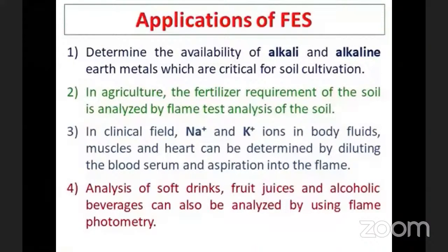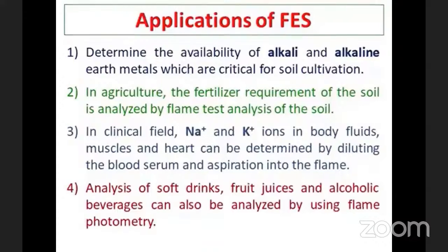Another application is in the clinical field. Na+ and K+ ions in the body fluids, muscles and heart can be determined by diluting the blood serum and aspirating it into the flame. Flame photometry can also be used for the analysis of soft drinks, fruit juices and alcoholic beverages.